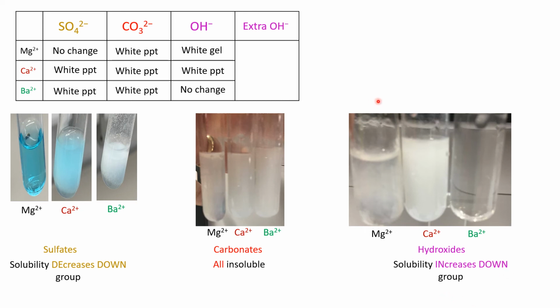Last little thing we had you do was adding some extra hydroxide to these. If we added extra hydroxide to those, nothing happened at all, no change. And that is because none of these are amphoteric.